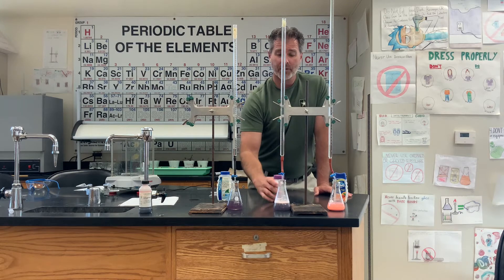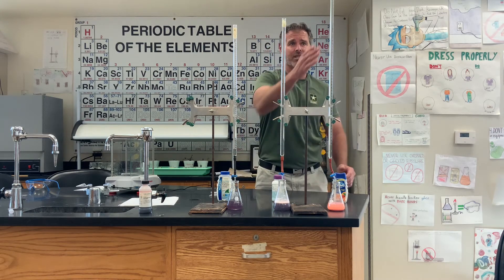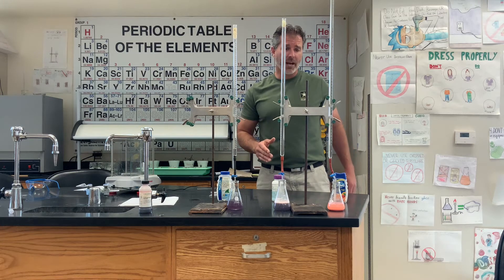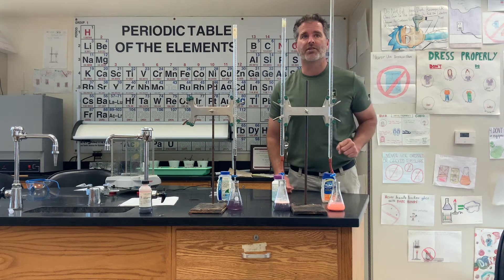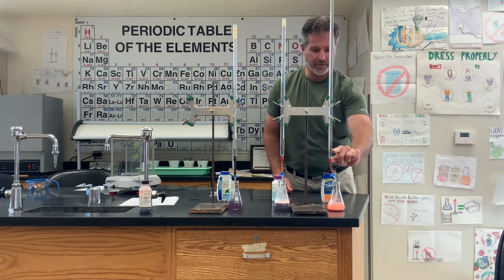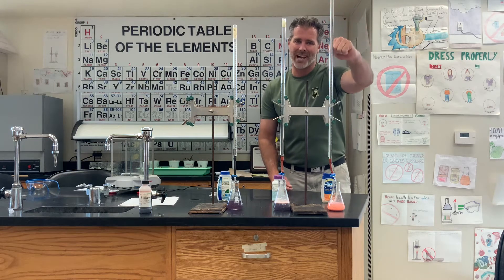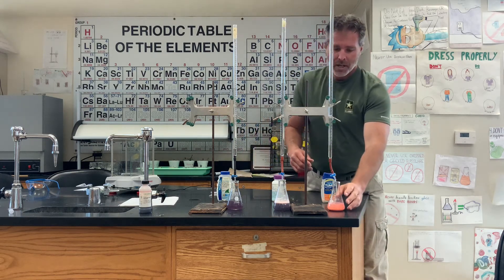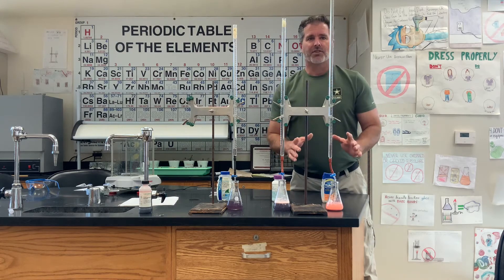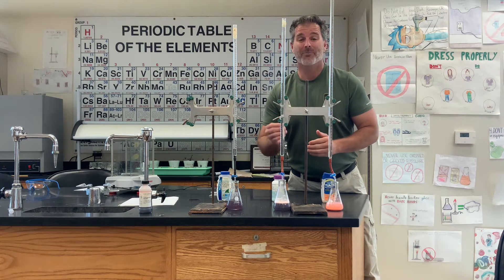The Rolaids in the middle is still working — it's hydrophobic and does not like to mix with water at all, so I have to stir it a lot. Now let me show you how to use the burette into the Tums. Zero is at the top and 50 is at the bottom, so it goes backwards — as the liquid goes down, the volume is increasing. A burette allows us to add drop by drop, about 0.05 milliliters at a time.